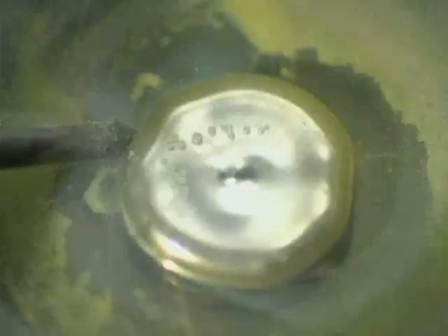The surface tension increases and the mercury drop becomes more spherical, pulling back from the nail. When the mercury and the iron nail no longer touch, mercury-1 sulfate again builds up on the surface, and the process repeats.